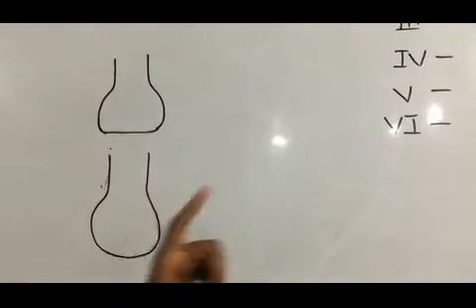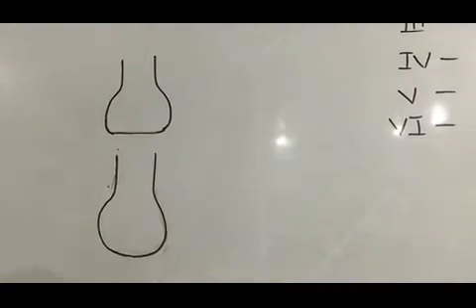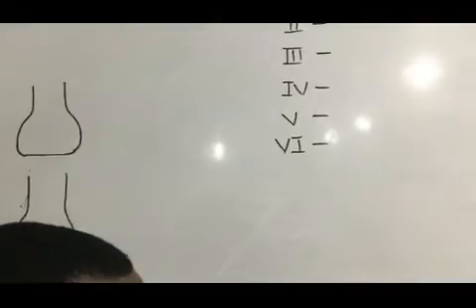So if you go and write flat bottom flask, you are wrong. This one is the round bottom flask.